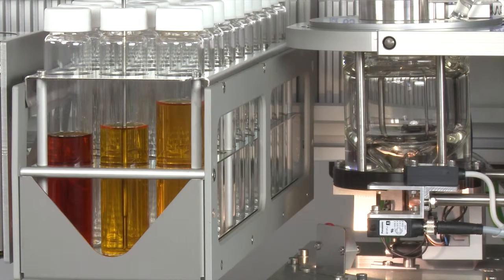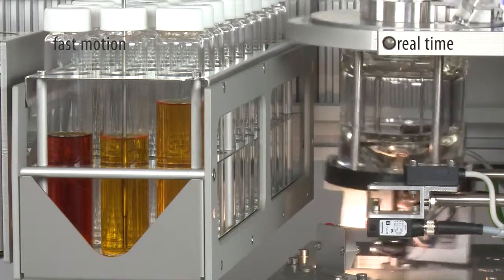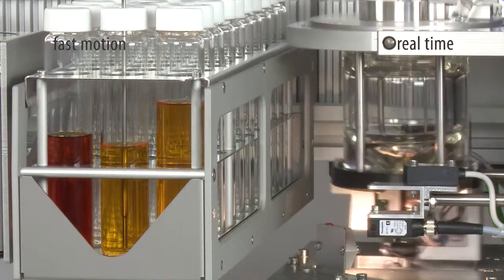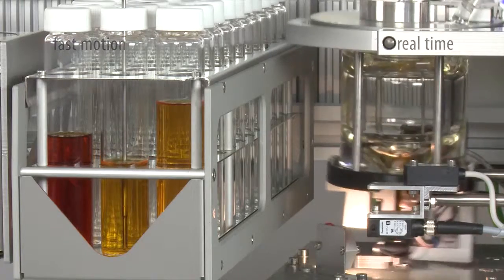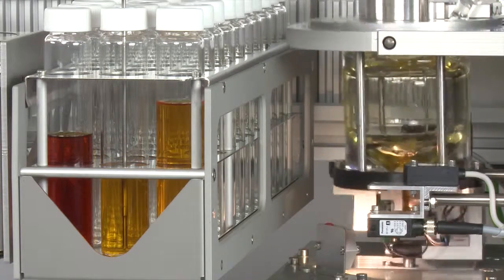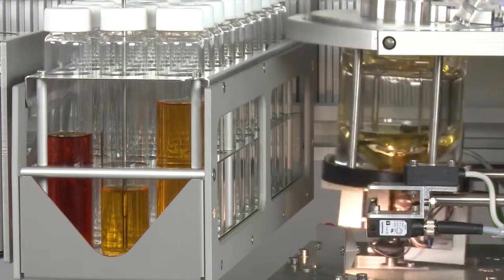By means of the vacuum, samples without exactly defined volume can be transferred from any common type of container into the evaporation chamber. The system recognizes immediately when the flask is empty.